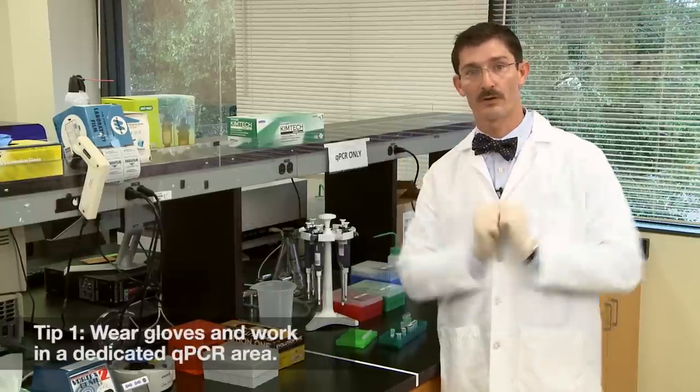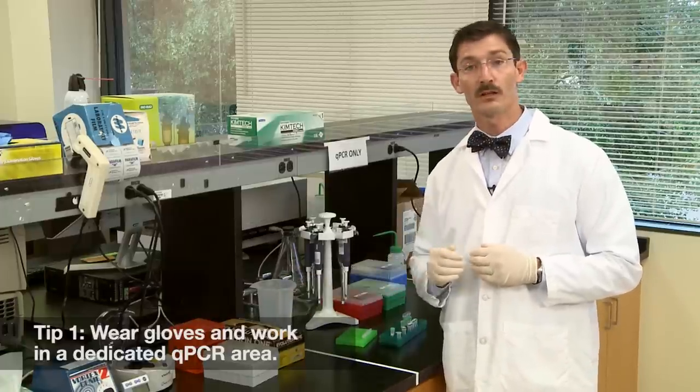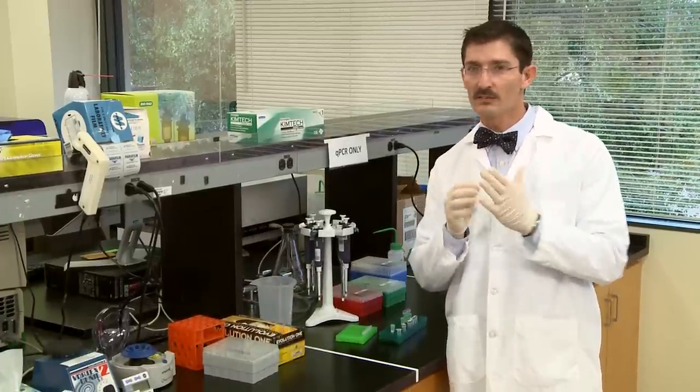Tip number one: always wear gloves and work in a dedicated qPCR area. Whenever choosing gloves, choose the right size for you — not too loose, not too snug.